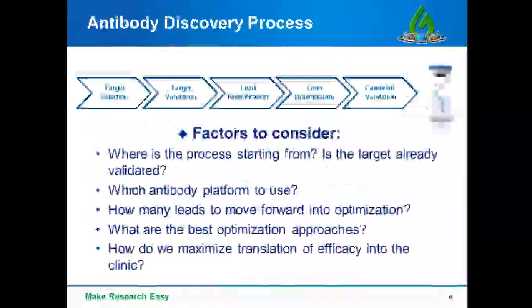For challenging targets like ion channel or GPCR receptors, DNA immunization, virus-like particle, membrane preps, or stably expressing cell lines will be used synergistically to boost the immune response. Intramuscular injection with or without adjuvant is usually sufficient for soluble protein antigens.